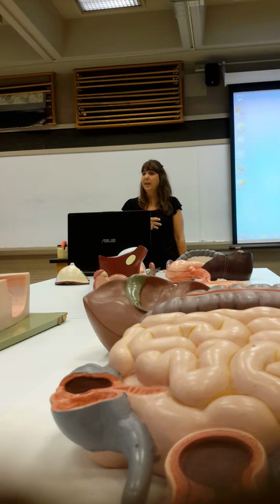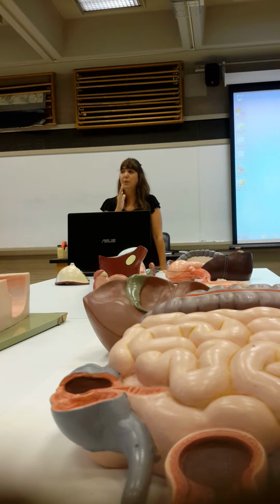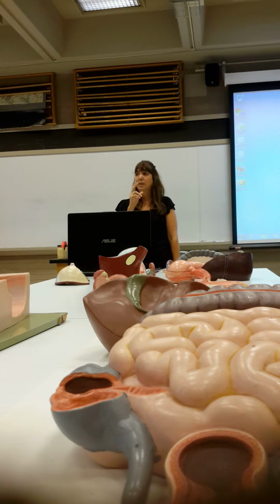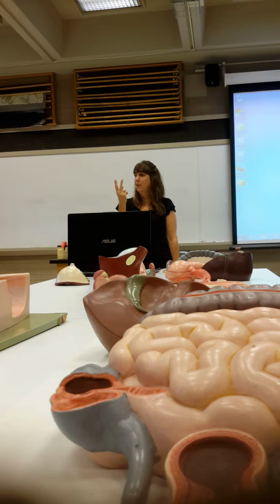So what were our 2 indicators that we took our strong base, sodium hydroxide, and neutralized it? What 2 things did we use to determine that? We used our CO2, and then we knew it became more acidic or neutral because we saw the color change to clear, and we did a pH. So that was our 3rd.